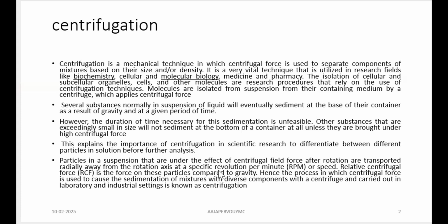But you have to keep certain factors common to all the particles which are separating. What are those? The centrifugation machine, the centrifugal force, then the time for which you are going to run it, right? And the relative centrifugal field, that is gravity, that also is going to be common to all of them.